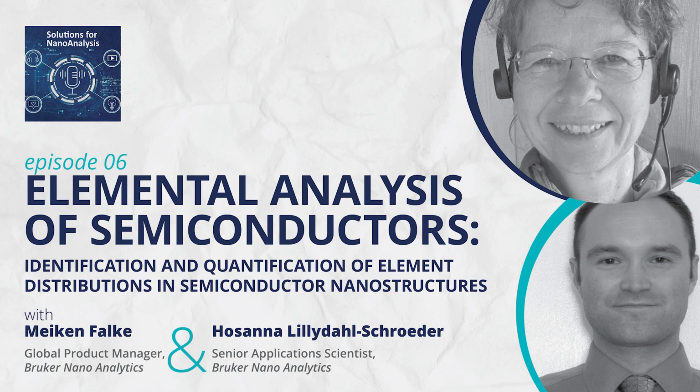One can see that with TKD. And if the orientation of particular functional layers is the one we want to have, and if there is the right combination of elements in that functional layer, that can be done in combined EDS and, for instance, TKD combined, and that again in SEM. So there are lots of ways for the future.